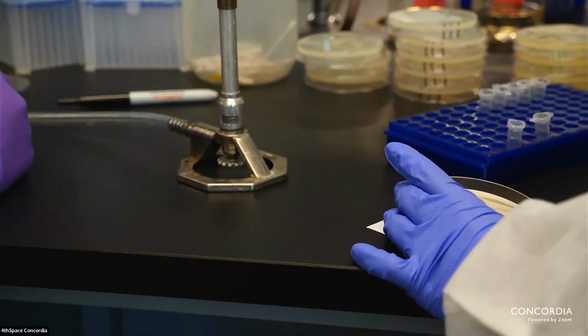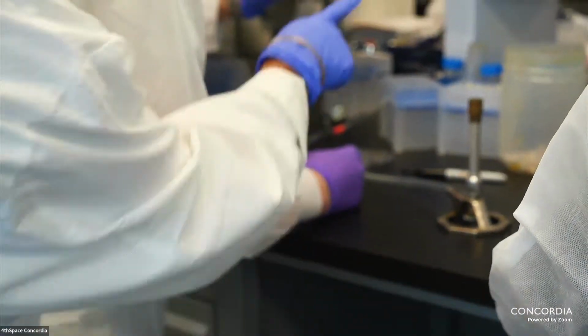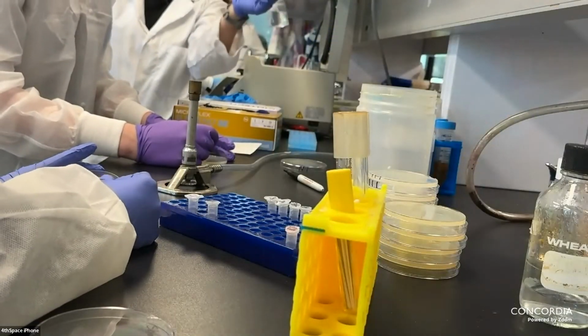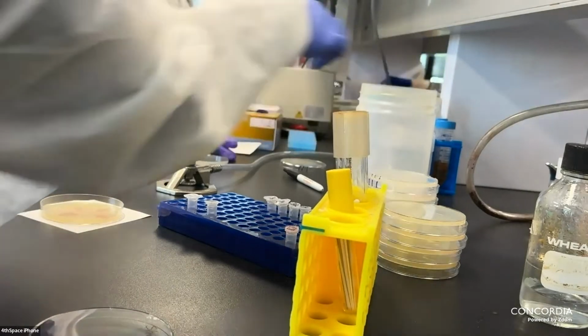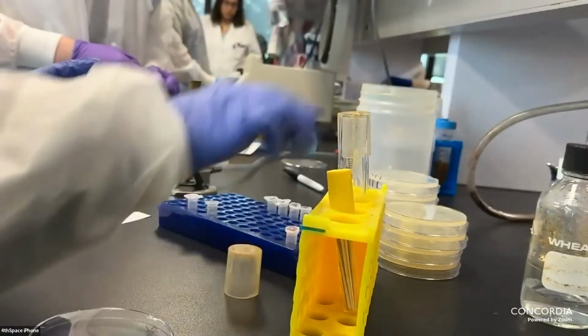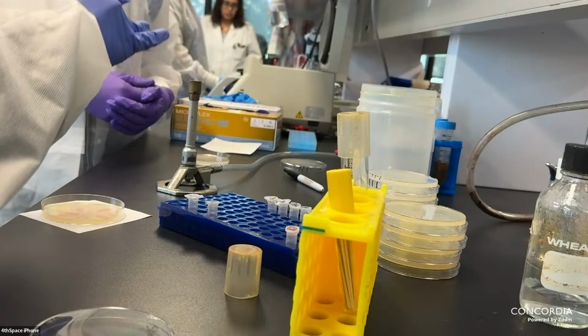Yeah, so once you dip it once, you can throw it out just in the bucket there. Yeah. And then take a new one to dip it again if you want more of the same color or a different color. And we have more too if you run out, so just let us know.